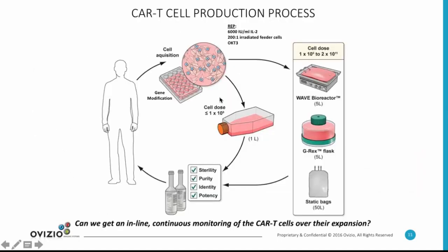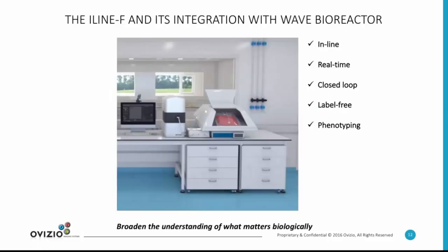So the big question for today is, I would say, can we get both the CAR T cell production process and the ILINE F connected, and can we get an inline continuous monitoring of CAR T cells over their expansion? The short answer is yes. The longer answer, I will go into more details now with a couple of examples of what we have already done and what we are doing at the moment.